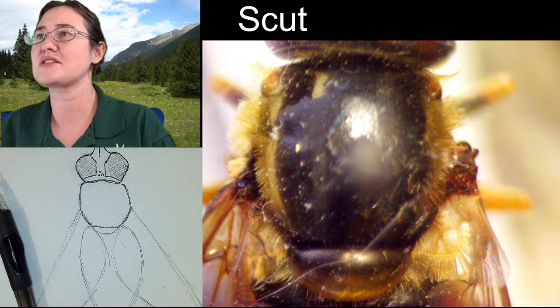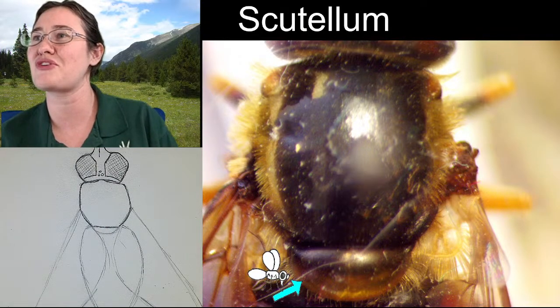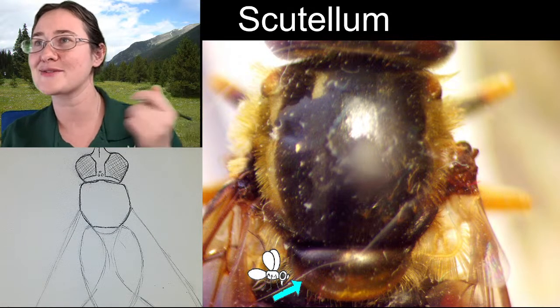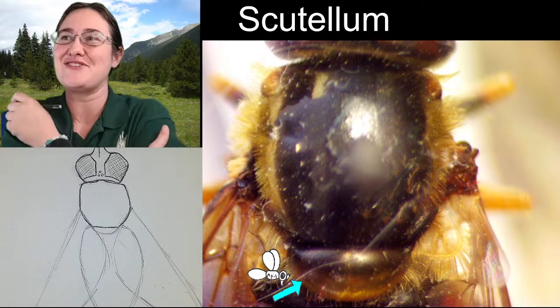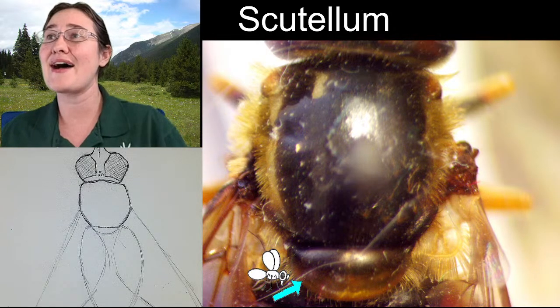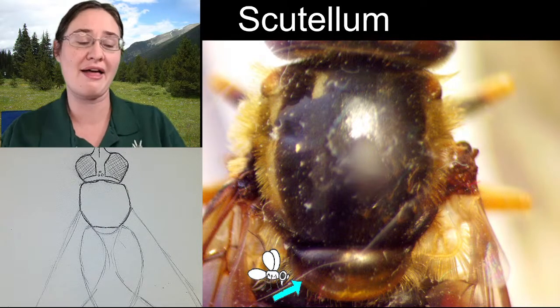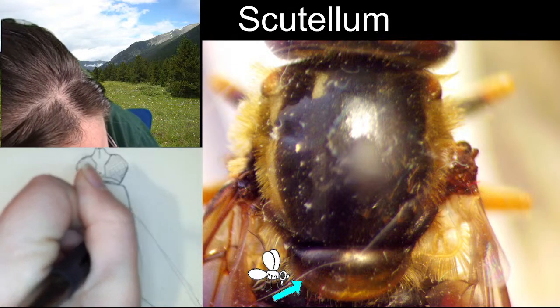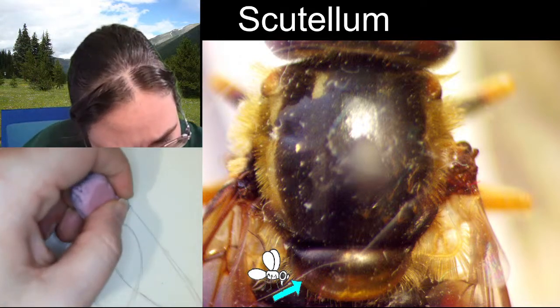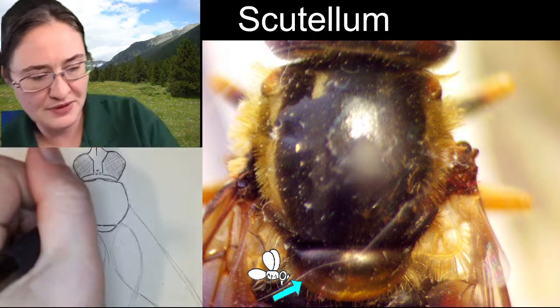scutellum. This little friendy right here, this little cummerbund guy, is the scutellum. He exists between the thorax and the abdomen. Well, I guess he's probably a part of the thorax, but he's right here before you get to the abdomen. And generally, the scutellum can be found in between wings. Flies and beetles and true bugs all have scutellum. I'm sure there are other insects that have scutellum, too, that I'm not thinking of right now.